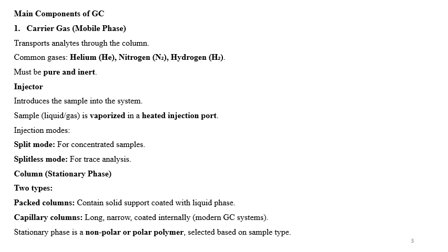Second is the injector, which introduces the sample into the system. The sample may be liquid or gas. It is vaporized in a heated injection port, and there are injection modes: split mode and splitless mode. Split mode is for concentrated samples and splitless mode is for trace analysis.